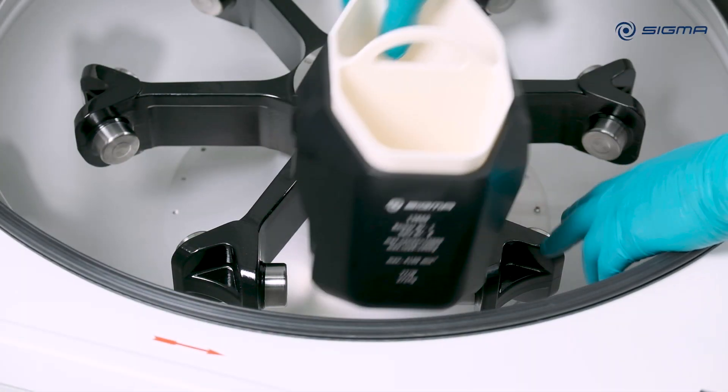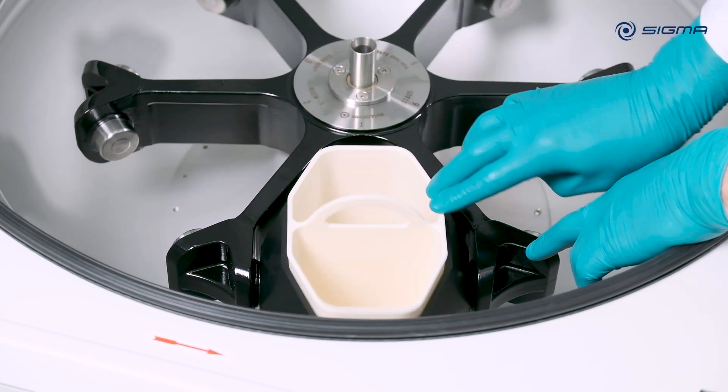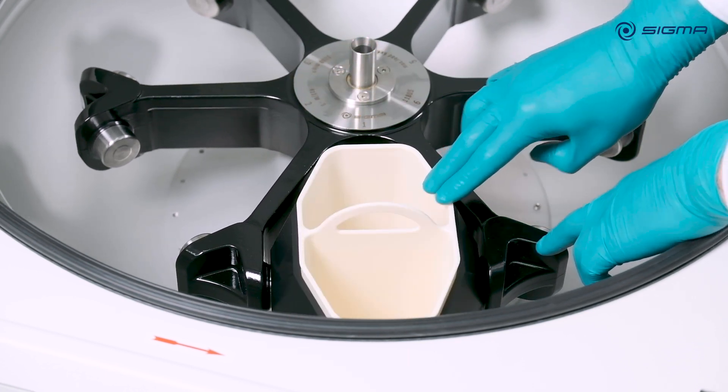When inserting the buckets, check that the buckets are numbered properly and are correctly positioned in the rotor. Each bucket has an assigned location.